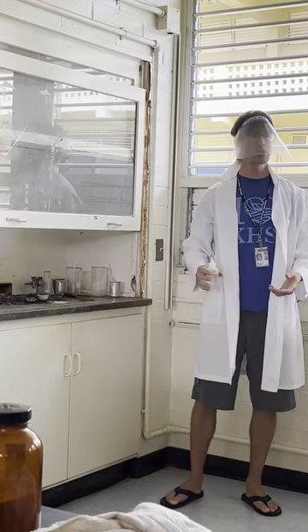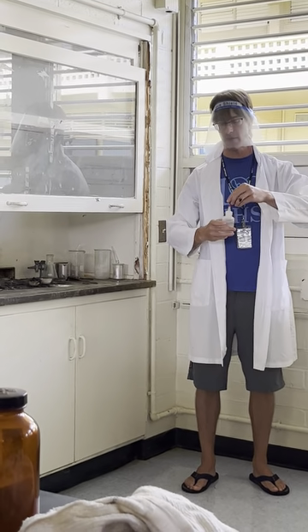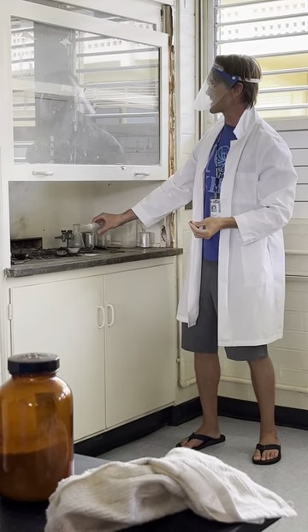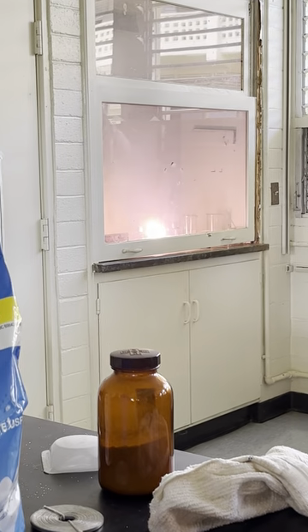So if we were to just let this sit, it would eventually react, but nobody has time for that. So what I have here is a bottle of concentrated sulfuric acid, and I'm just going to drop a few drops on it like that and step way back.